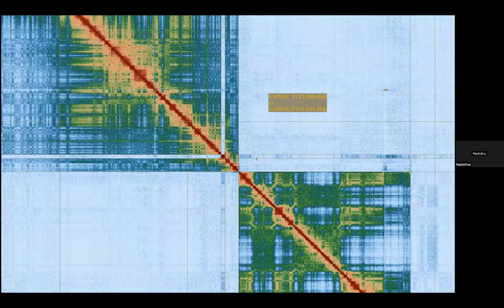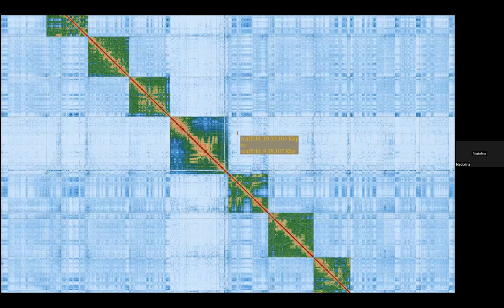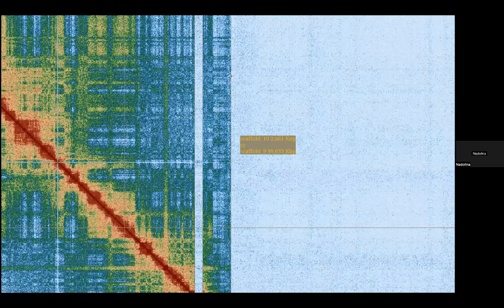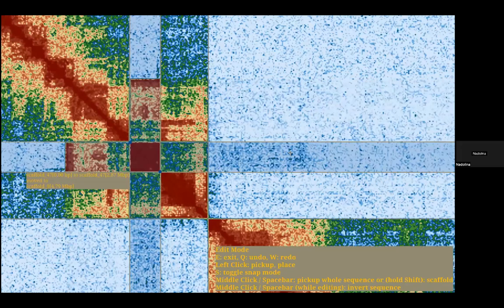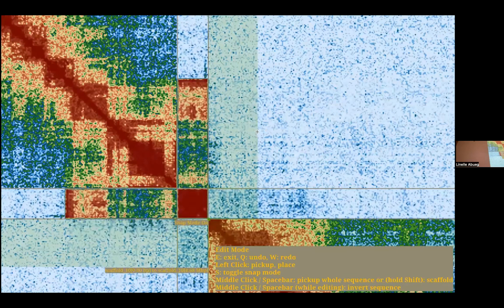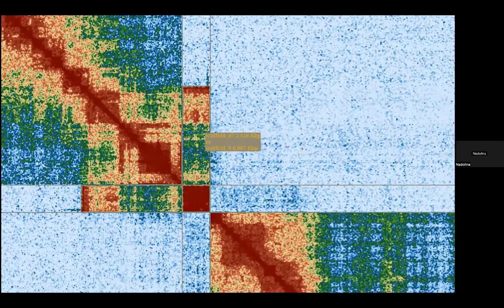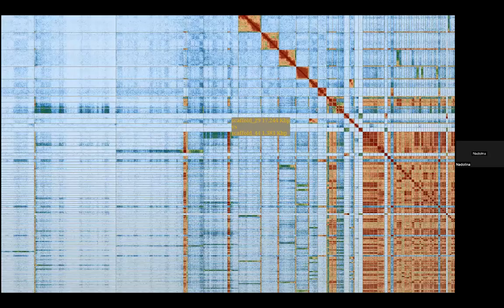But actually, perhaps not, because that might actually be the PAR region. What did I do here? Well, keep in mind, I did do this several months ago at this point. Yeah, I think this is showing signal because it is forming the PAR. I'm not sure how I assembled it in the first place. But because it is in several pieces right now. But your Y chromosome will also show a dip in signal. I wonder if we might be able to find it down here.